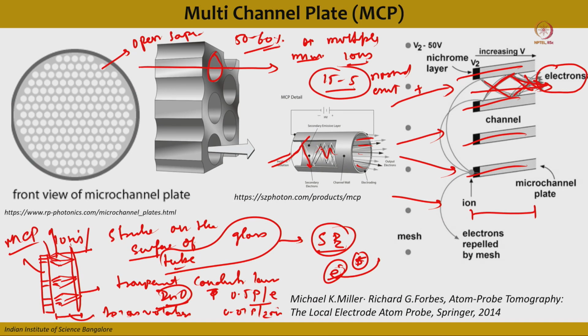The most important points are: ultra high vacuum, cryogenic temperature, a high DC voltage, a sharp tip, imaging gas at a low pressure, and the use of MCP multi-channel plates just ahead of the phosphor screen, so that a large amount of photons is released on the phosphor screen without damaging it.